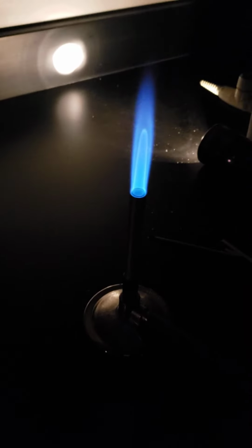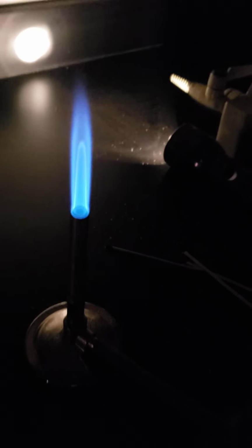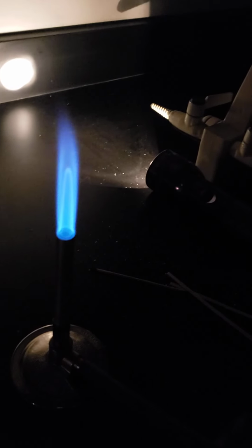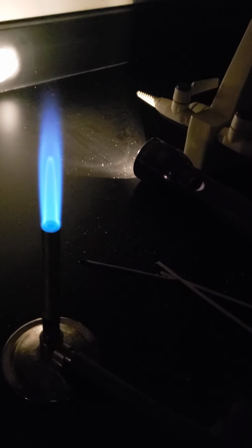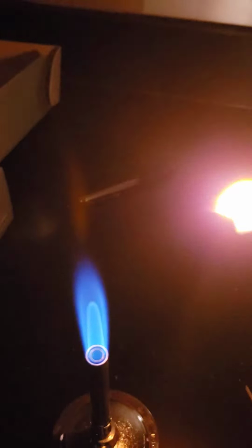I haven't done this on video before. So I'm going to take some sodium chloride, get quite a bit of it on a stick, and let's see what happens when I put it in the fire. So let's see if I got some samples here. Maybe hard to see, but maybe kind of an orange glow to it. So that was the sodium.